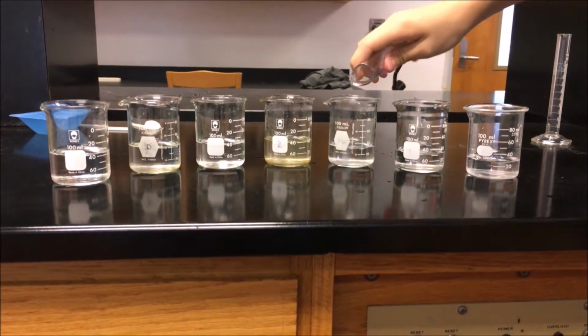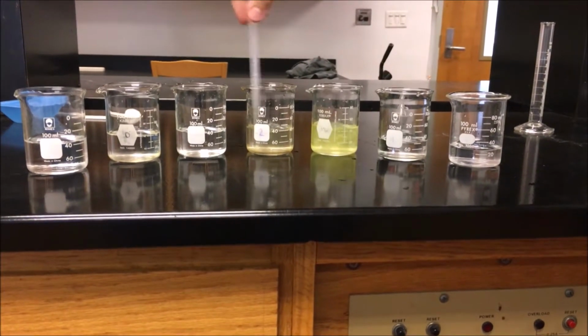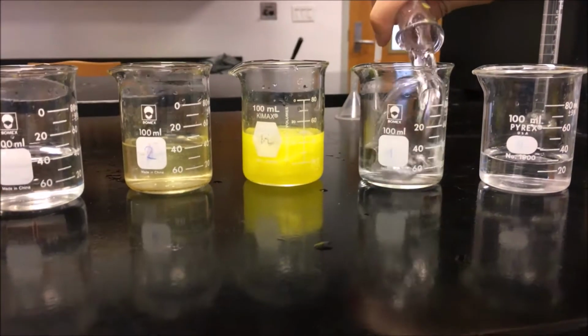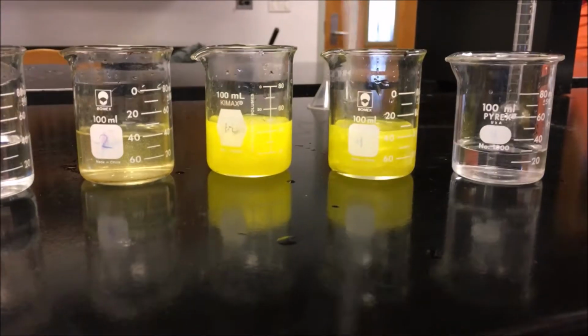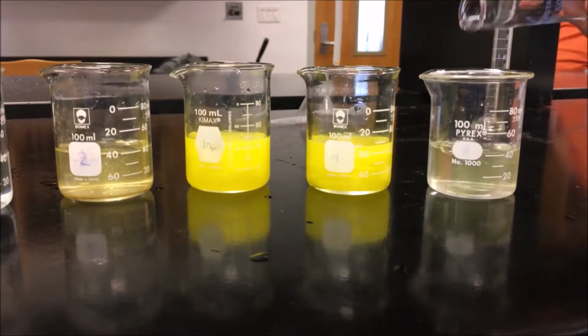Add 13 milliliters to the fifth beaker, and the precipitate becomes obvious. The same thing happens for the sixth and last beaker by adding 14 milliliters and 16 milliliters respectively. Make sure to stir occasionally so the reaction happens faster.